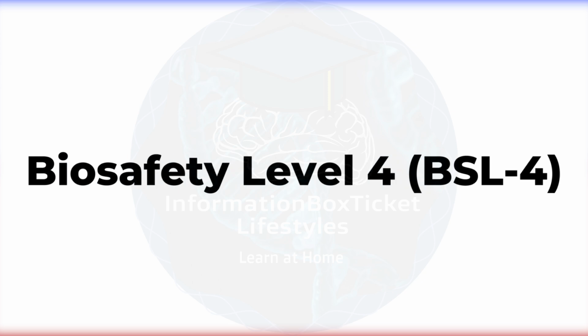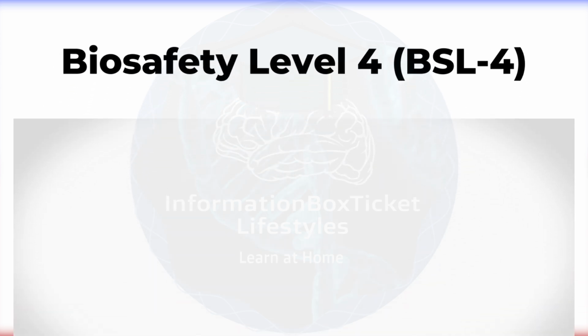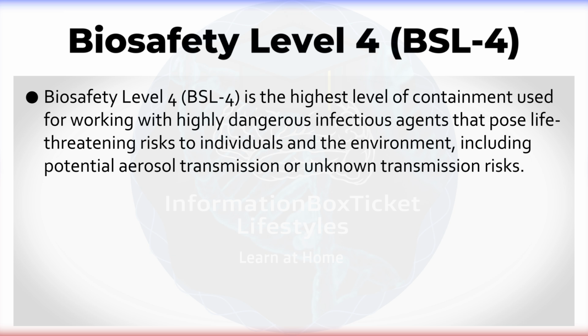Biosafety Level 4. Biosafety Level 4, BSL-4, is the highest level of containment used for working with highly dangerous infectious agents that pose life-threatening risks to individuals and the environment, including potential aerosol transmission or unknown transmission risks.